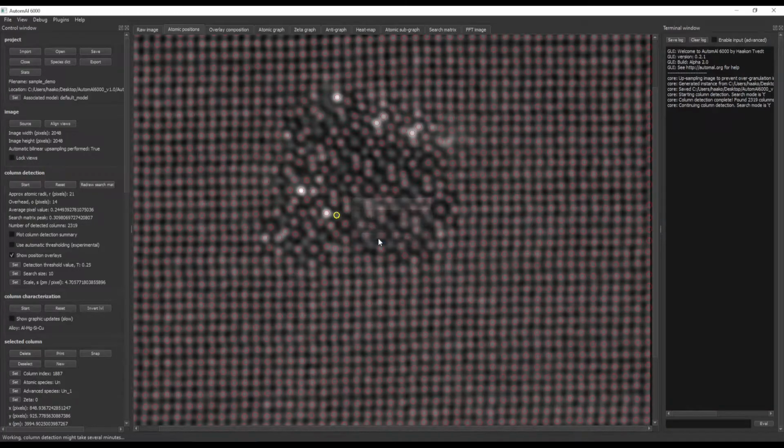It will start from where it left off, which means that now it will not take so much time. So as you get closer and closer, the method is faster and faster, and in the end it will just be seconds. So I'm hoping to get it up now fairly quickly.